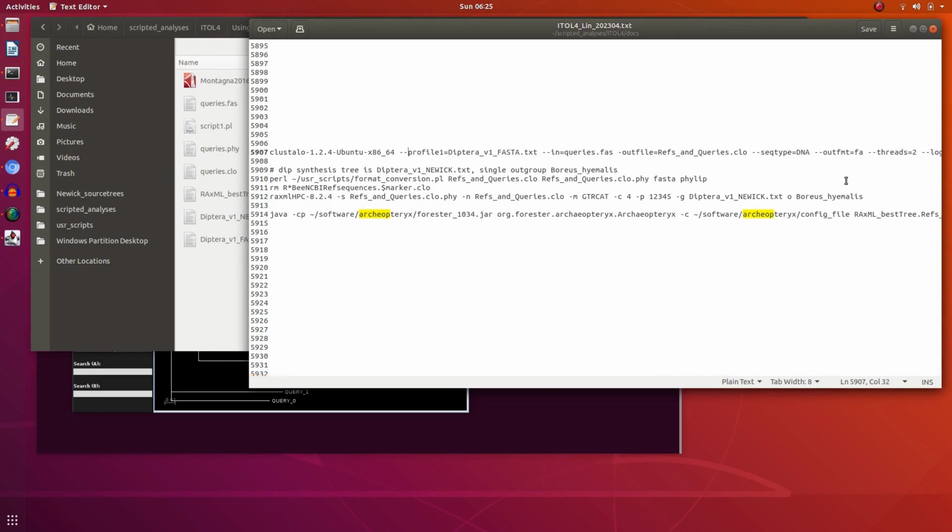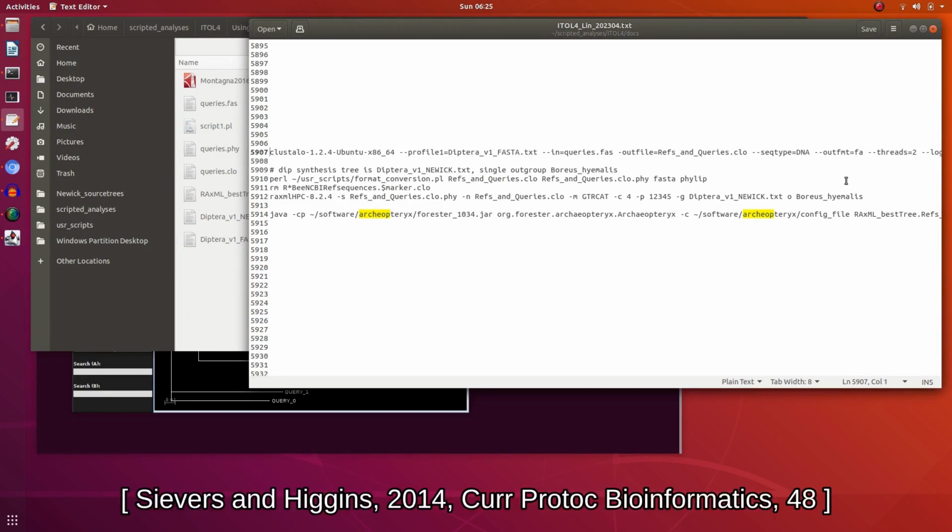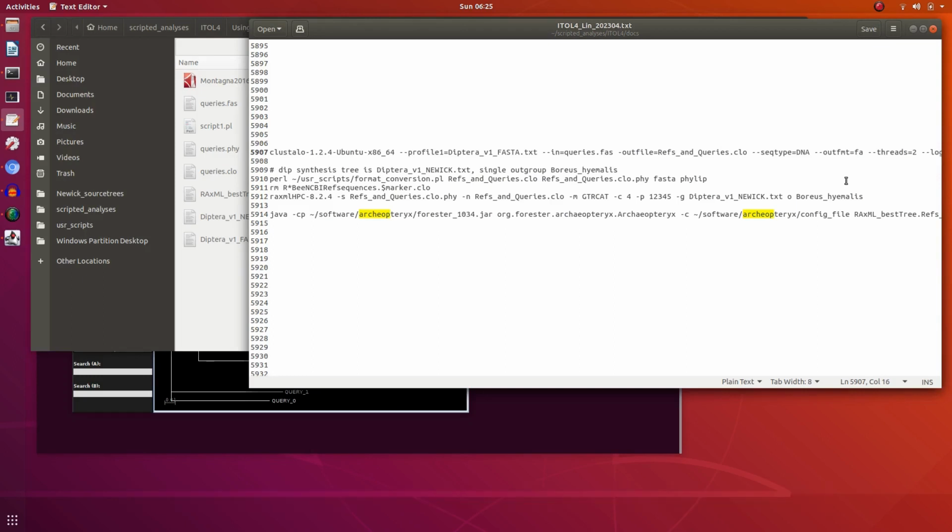So we want to be doing profile alignment, which is a version of multiple sequence alignment where you have a fixed reference alignment. And in this quick demonstration, I'll use Clustal Omega to do this. There's various software for doing reference alignment, but this should work fine.